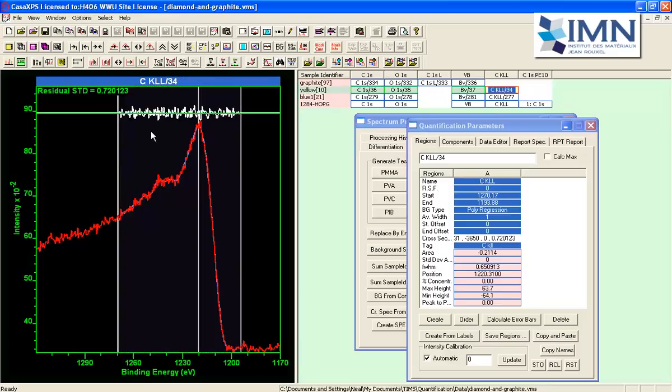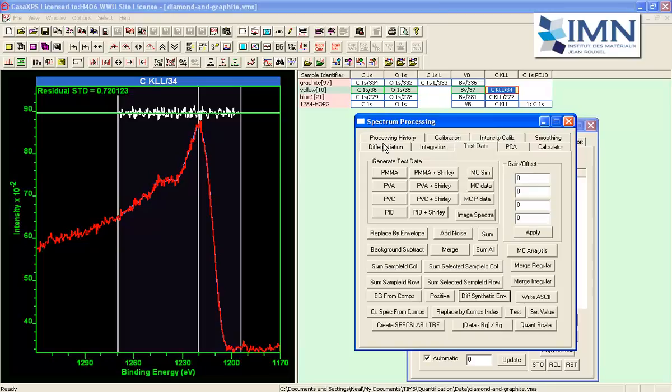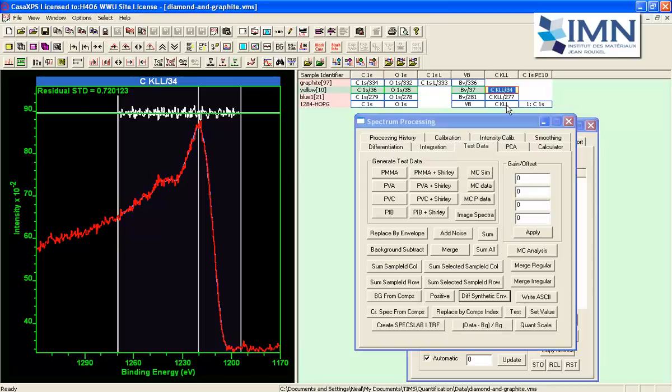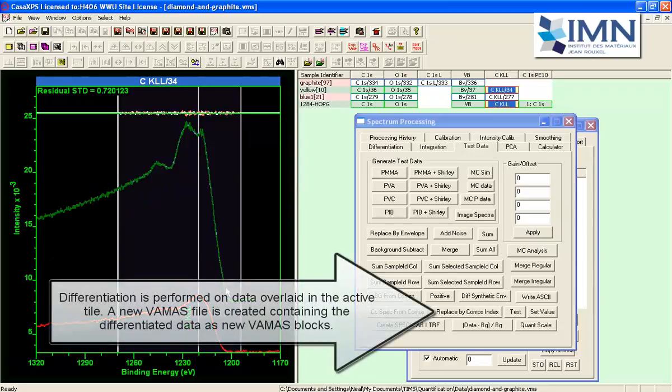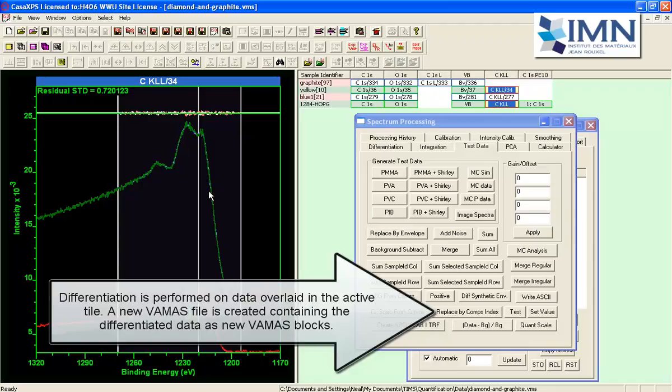Perhaps a little bit more than you might expect but it's within the region of what you would expect for these type of data so having done so let's put these two together in fact overlay them so we can see both of these that now have a region where there's a synthetic envelope.